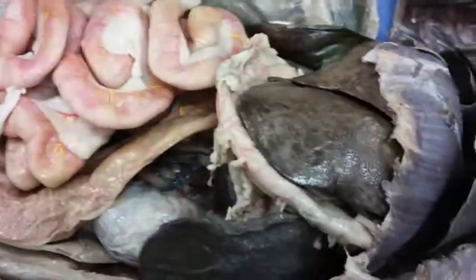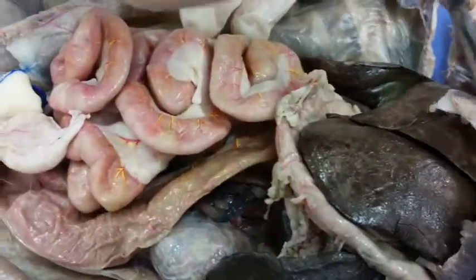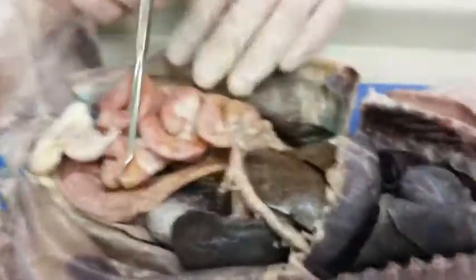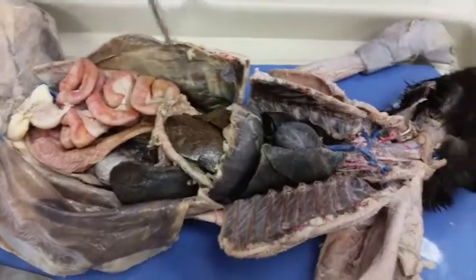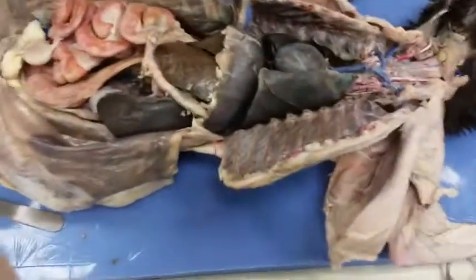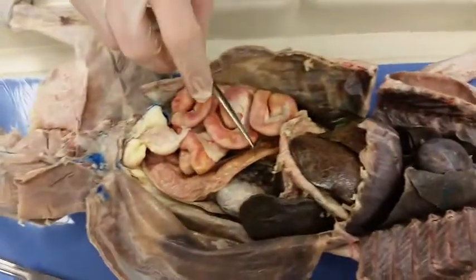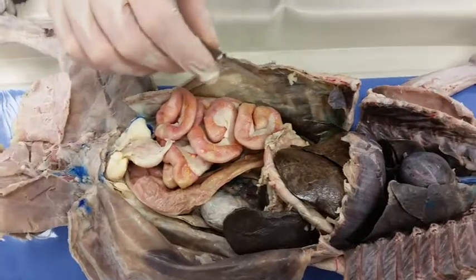Liver, which is very fun, it's everywhere. The diaphragm, right here, separating the abdominal and thoracic cavities. Thoracic cavity, abdominal cavity. Pretty straightforward. Okay. Once again, the greater omentum should be completely covering this area where the intestine, the stomach, all that stuff, that should all be covered by greater omentum.